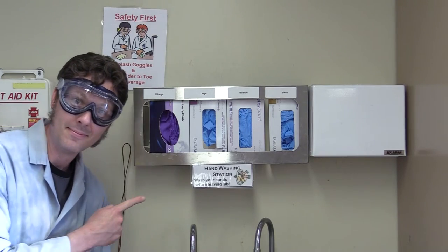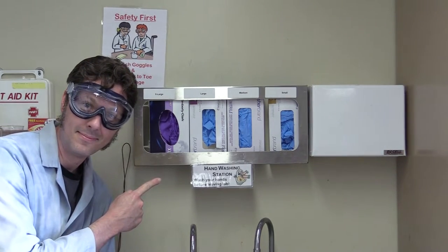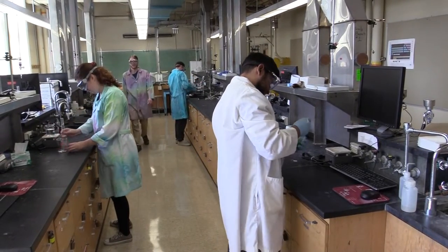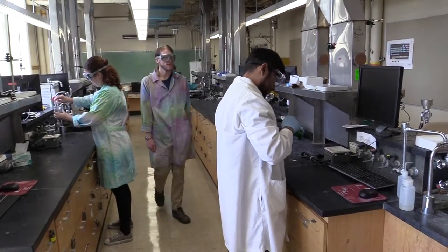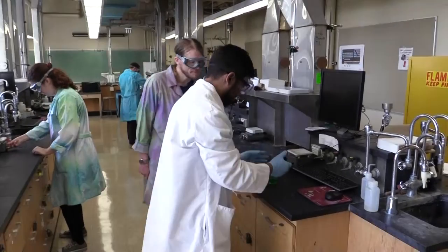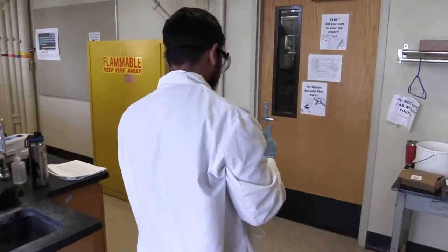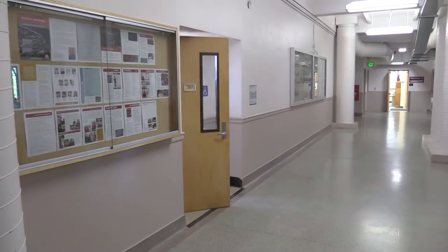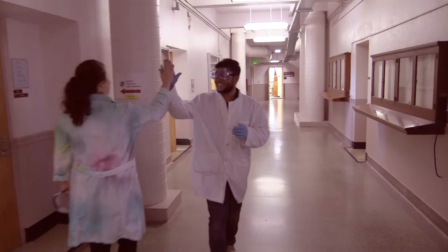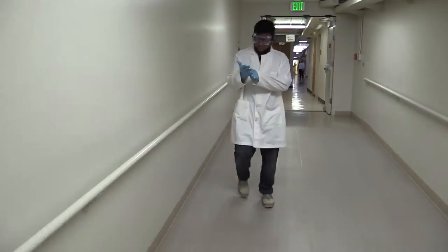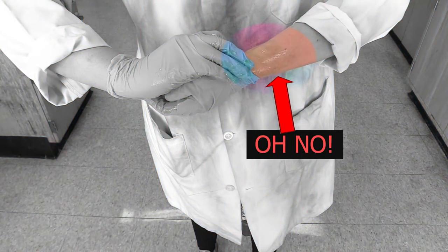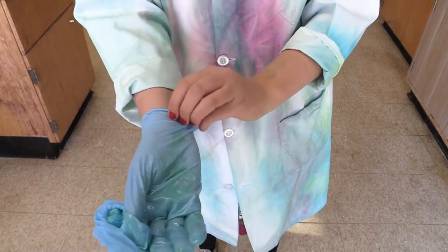If you need to wear gloves, you'll find whatever size you need in every single lab room. One of the most important things to remember is you can't wear them out in the hallways. Let's say you're working with something nasty and you get it on your gloves. Then your TA asks you to get more paper towels from the stock room. All along the way, anything you touch with your gloved hand will get contaminated, and if someone else comes along and touches it, they won't be happy with you. There is a right way to remove your gloves that will help you keep anything that's on them off of you.